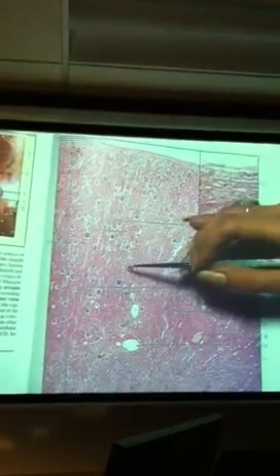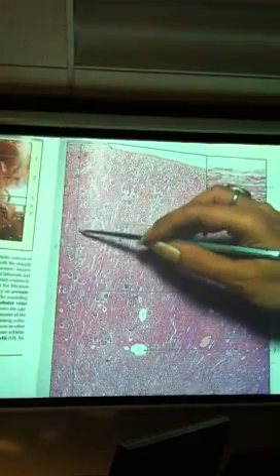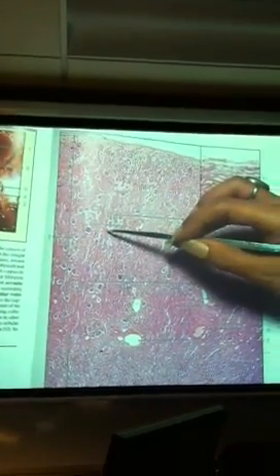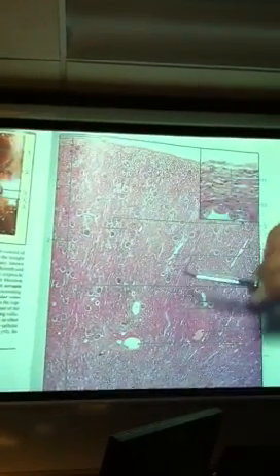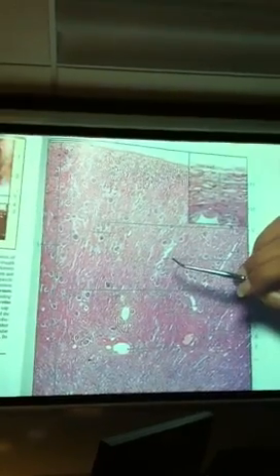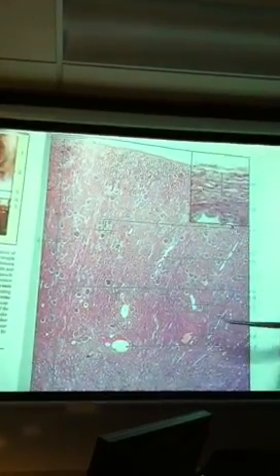If you look at the kidney slide, do you see these spots here? Do you see that? Yes. Those are the renal corpuscles.